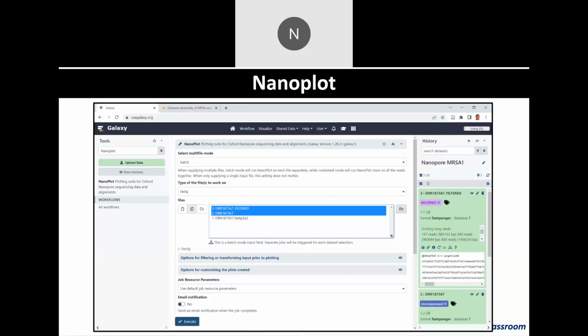Assembly, I told you yesterday also, is the most intensive part of this entire exercise because you have so many reads and each read has to be aligned. Here you're doing a de novo assembly because they're long reads. What you're checking for is overlaps between reads, and if there is a unique overlap, you're putting them together. So this is like all versus all comparisons. Therefore, it takes a long time, right? That is why command line is advantageous. If you know programming, that gets a lot easier. And if you have a high speed system in your lab, then it becomes high performance computing. Then it becomes a lot easier to do it.